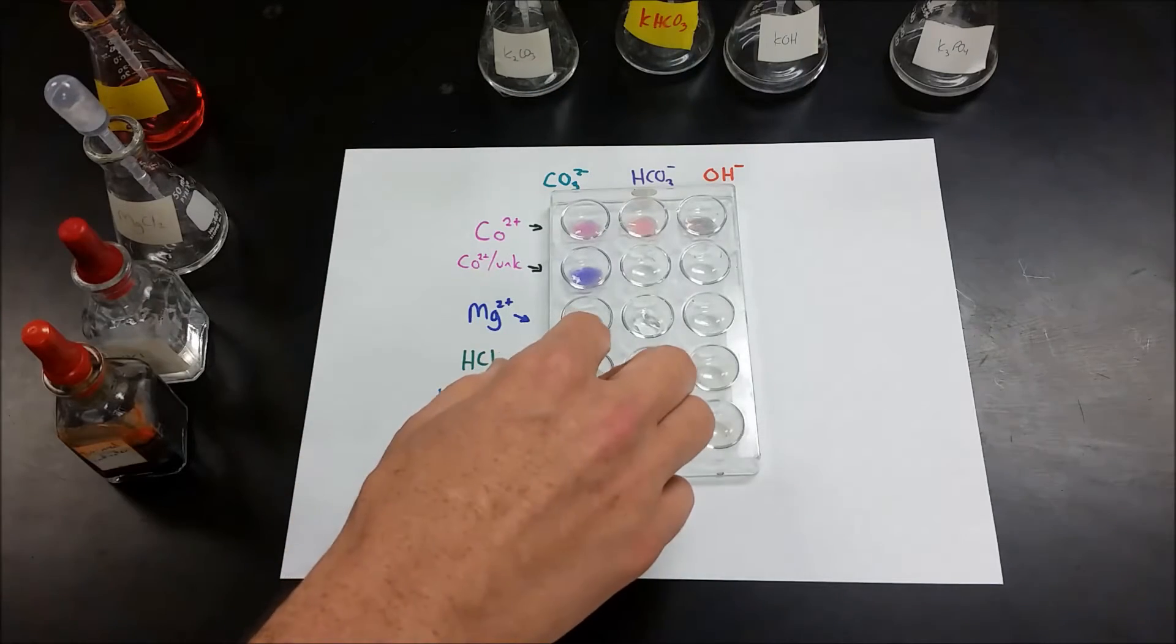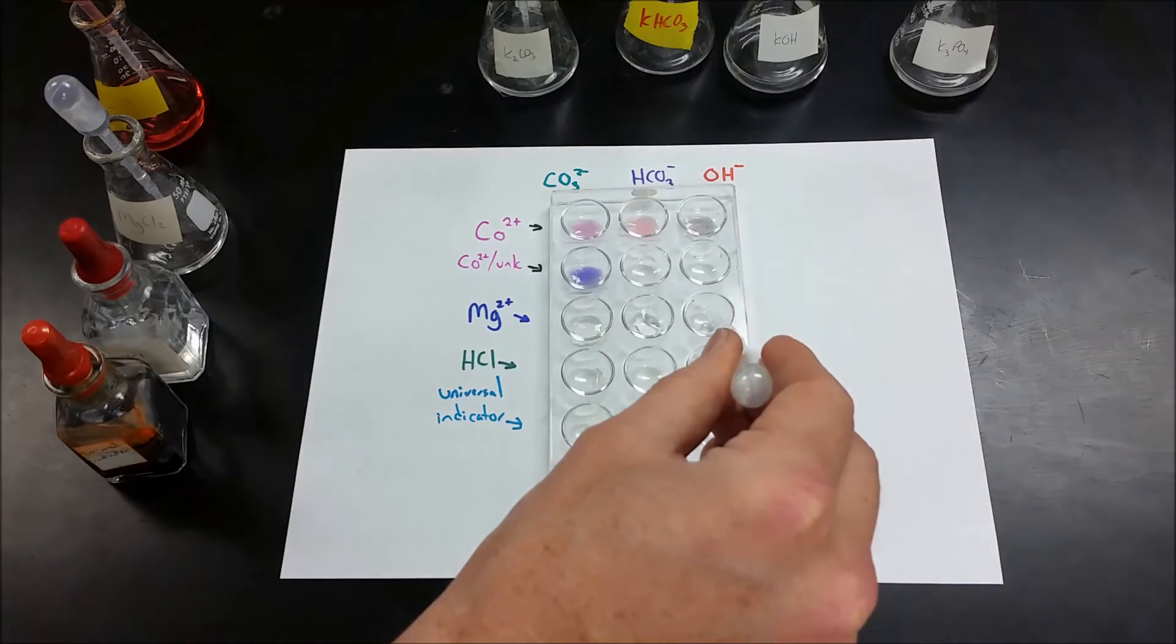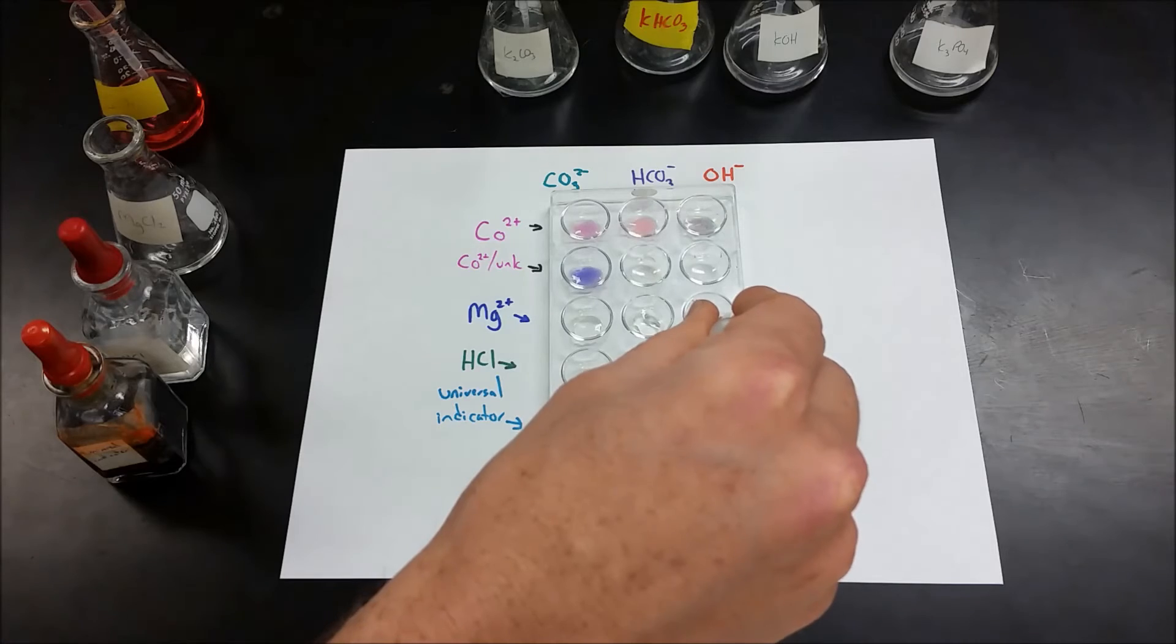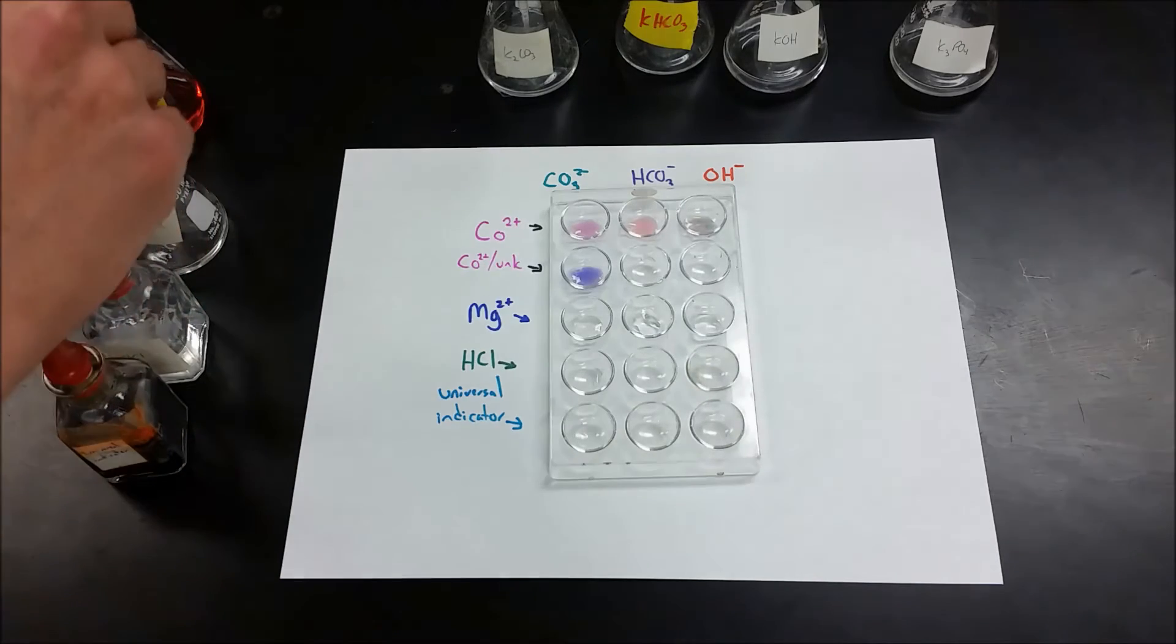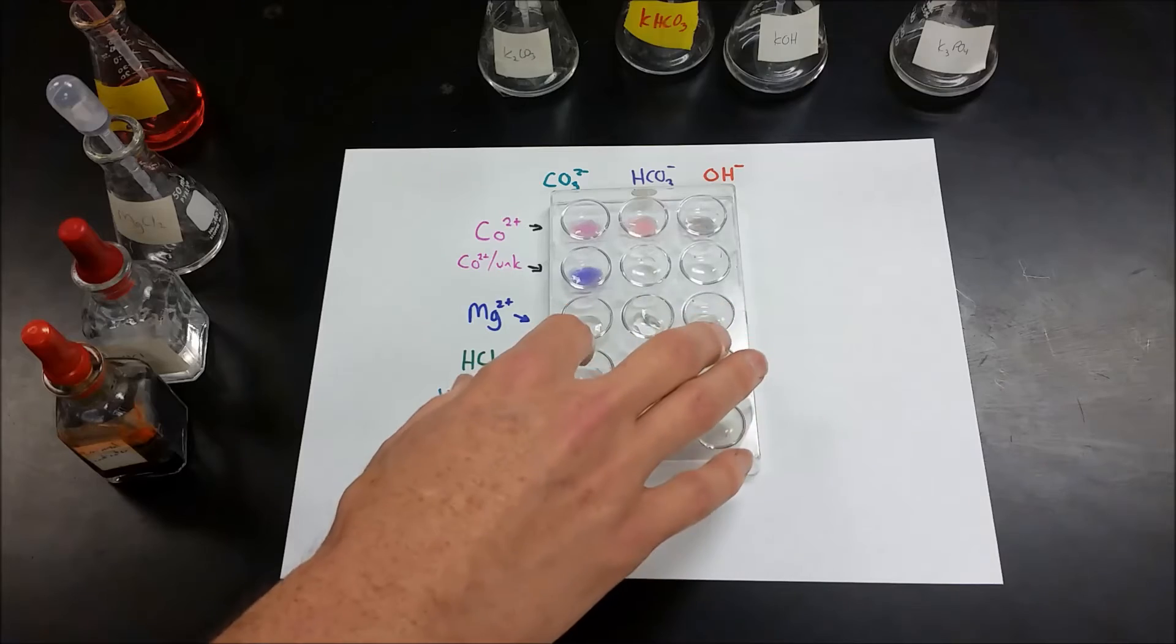And what we find is we will form a precipitate for one, but not the other. Now, if we had done the hydroxide and continued on testing, we would match one of those results. So we have to start with that cobalt test to make sure that we don't fall into a trap where we confuse the hydroxide and the carbonate.